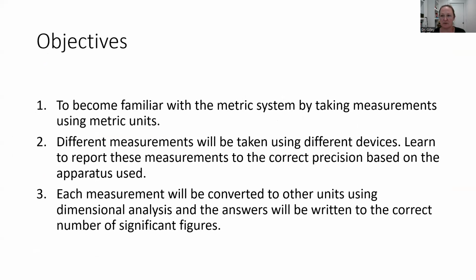So there are several objectives for this experiment. We would like you guys to become familiar with the metric system by taking measurements using metric units. As you know, the United States is one of the few countries to still use the non-metric system for measurement, so measuring things in inches, for example, instead of centimeters. But when we are doing science, we're going to be using the metric system.